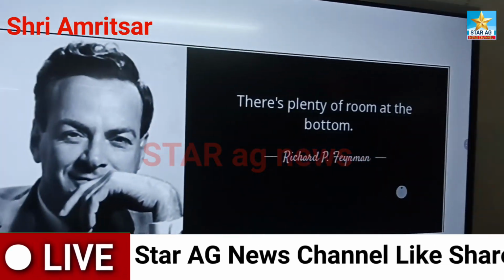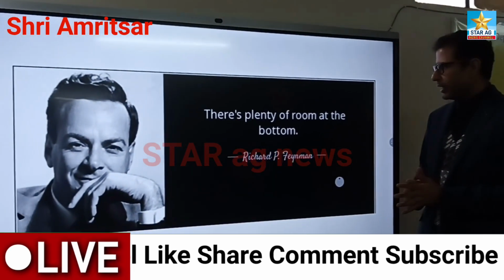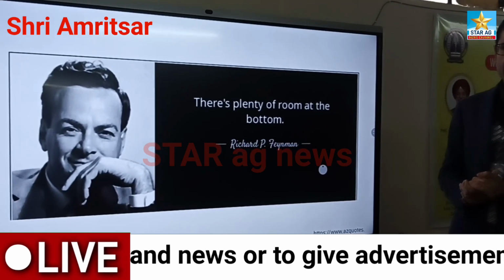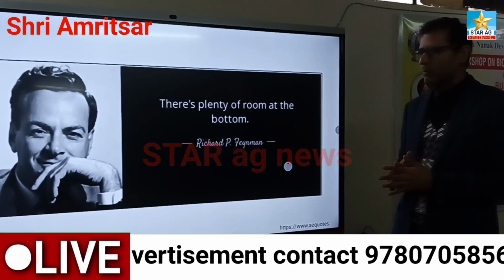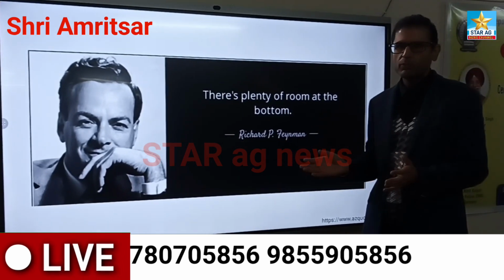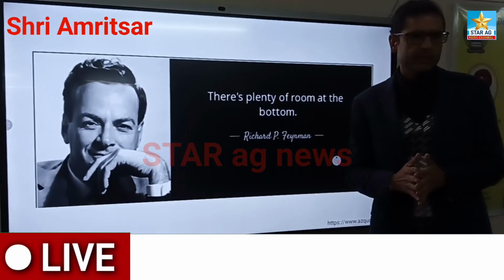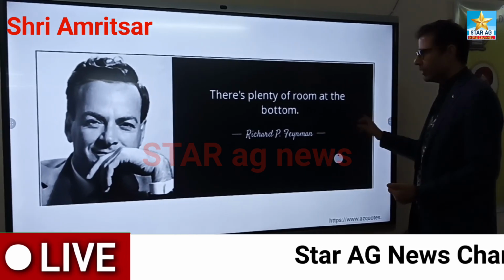So I would like to start with a quotation from a famous physicist, Richard Feynman, who wrote an article saying that there is plenty of room at the bottom. What Feynman was referring to was that we have enough space at a scale which is not visible to our naked eyes. At the nanometer or molecular scale, there is enough room to manipulate and engineer things. But the first step in doing this is to be able to see things at that scale, and that is where microscopy becomes very important.